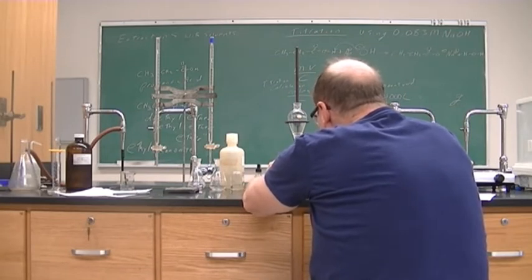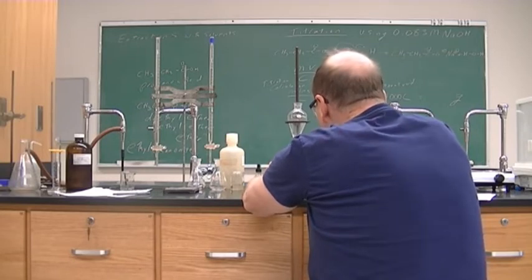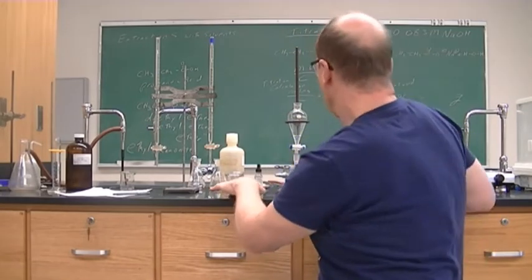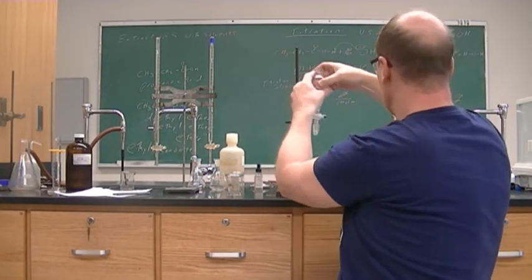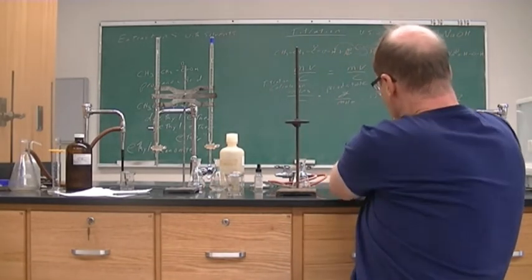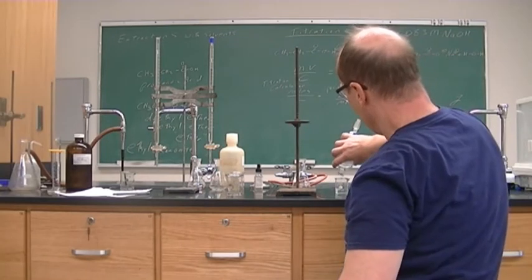As soon as my layer is down in this stopcock, I close it. So all of the aqueous acid and all the acid that's in the ether layer. So I'm dumping out the ether layer into my used ether container.